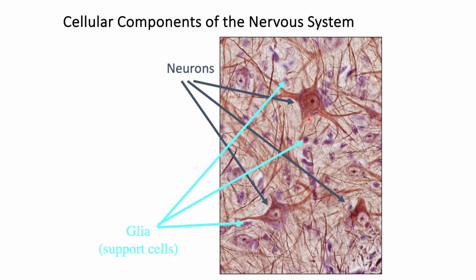The neurons, as I've indicated, you can easily see them by their stellate appearance, star shape, okay, with the cytoplasm and the nucleus. There you can see there's a nucleus within and then the cytoplasm, and these are extensions, so they are dendrites. You can see another one here.